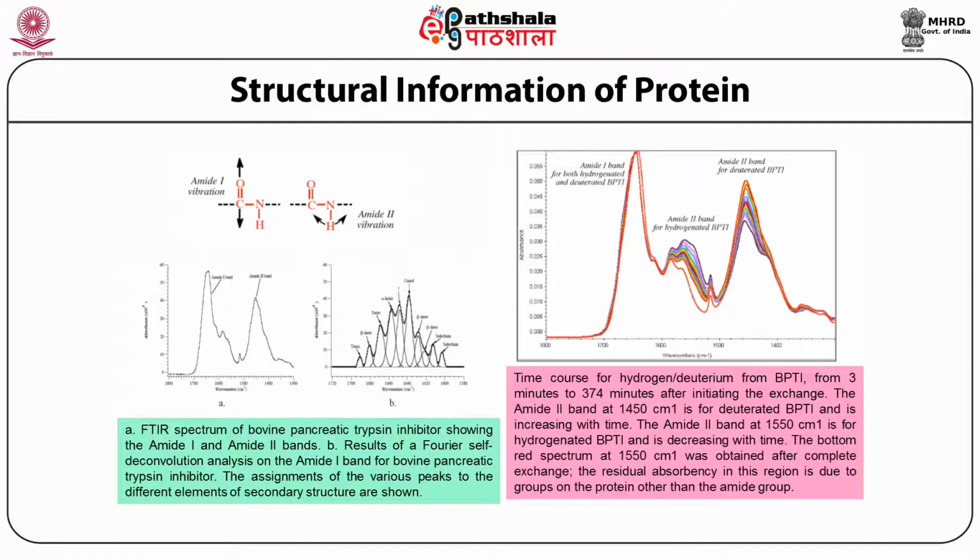So FTIR is extensively used to know the structural content of the protein. Not only this, the change in the structure, change in the conformation and change in the dynamics of the protein can also be measured by the use of FTIR.